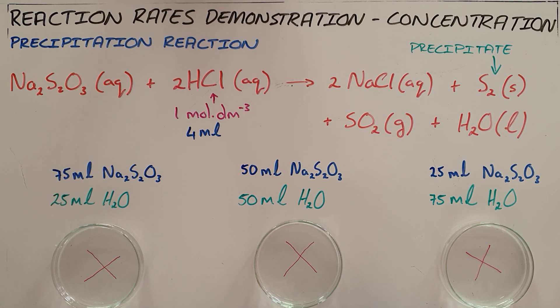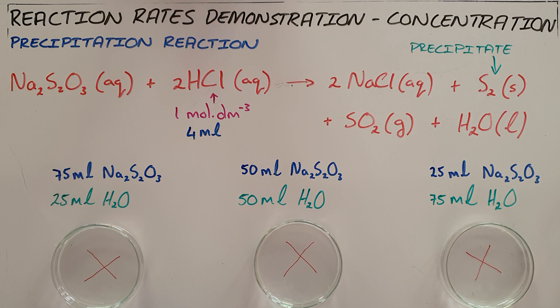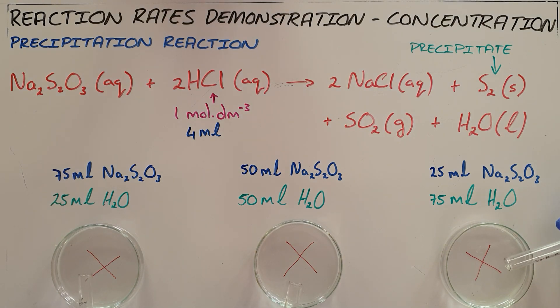What we're now going to do is simultaneously add four milliliters of one molar solution of hydrochloric acid to each of these and observe the rate at which each of these reactions happen. It's important to add the acids all at the same time to ensure that the reaction proceeds at the same rate.